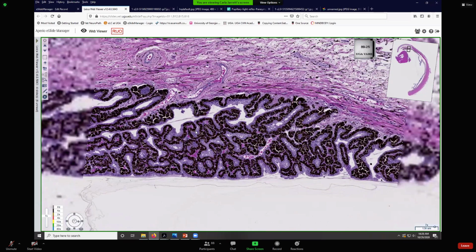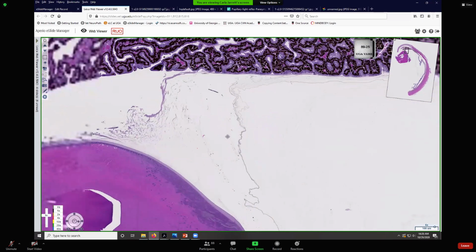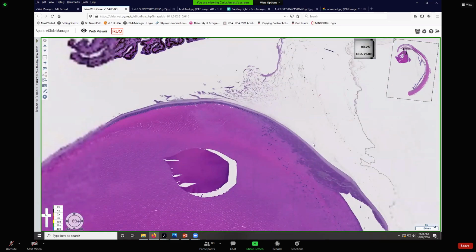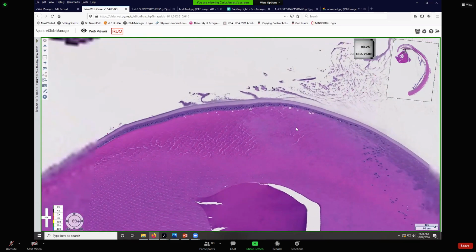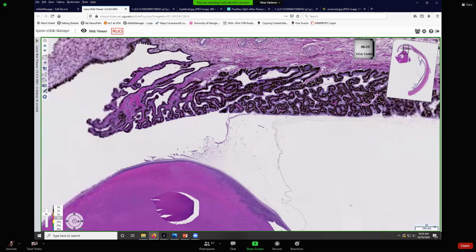And all those elastic fibers, or we call them zonular fibers, come over here and attach to the capsule, which is a big, thick, modified basement membrane. So we've got all these elastic rubber bands running from that capsule of the lens all the way down between those ciliary processes to the ciliary body. And that happens all the way around. So we're keeping this constant tension. We're pulling on the capsule of this lens, which, if you're young like you are, is soft and pliable.